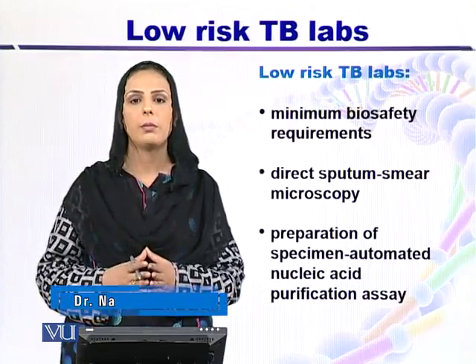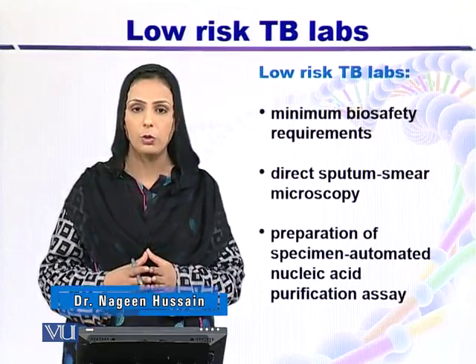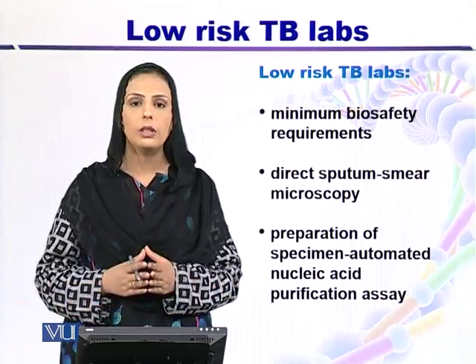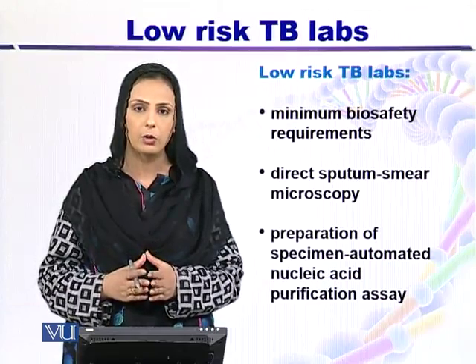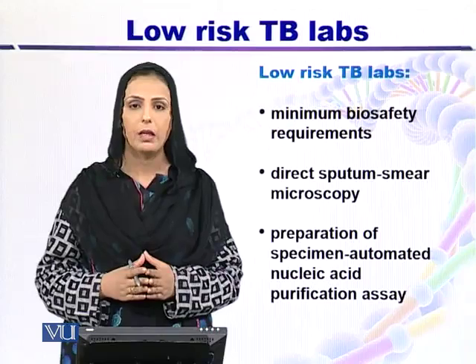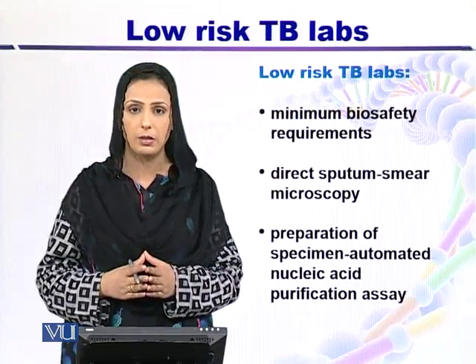In the TB lab, the first step for the identification of Mycobacterium tuberculosis is simply microscopy. In order to identify Mycobacterium tuberculosis through a light microscope, we use a stain known as Ziehl-Neelsen staining. And the first step of this staining is the preparation of smear.